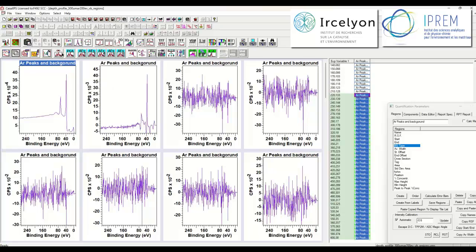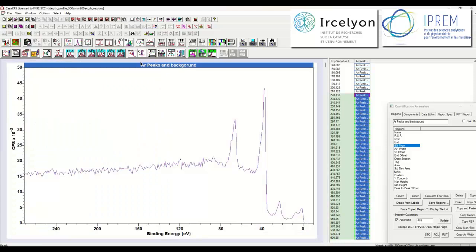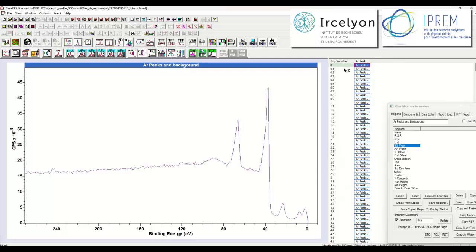So let's return these to their state where we can process the different spectra based on this set of data. So let's reconstruct using two abstract factors and then construct different spectra.